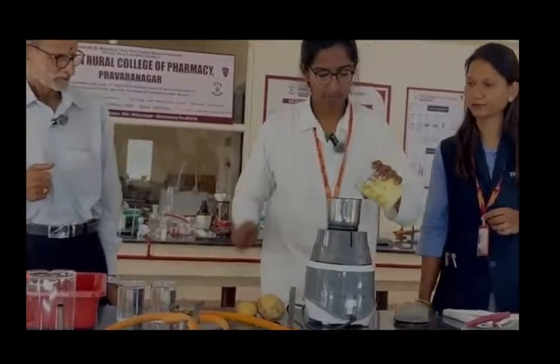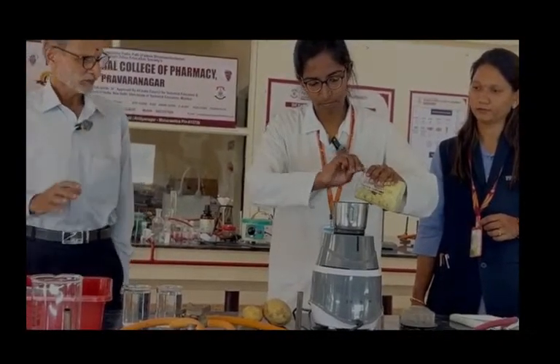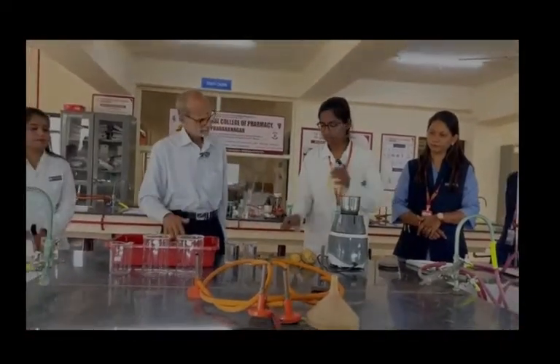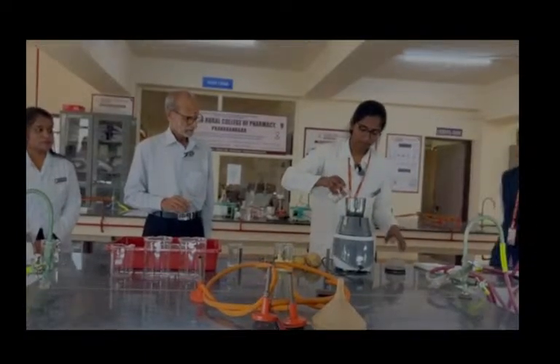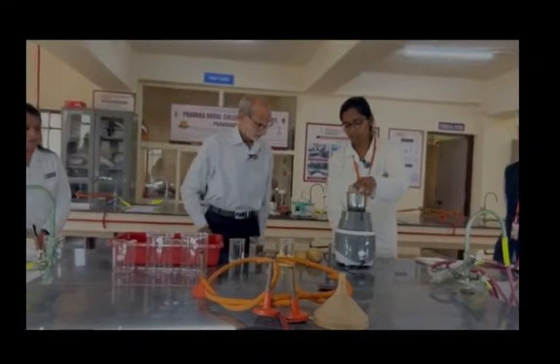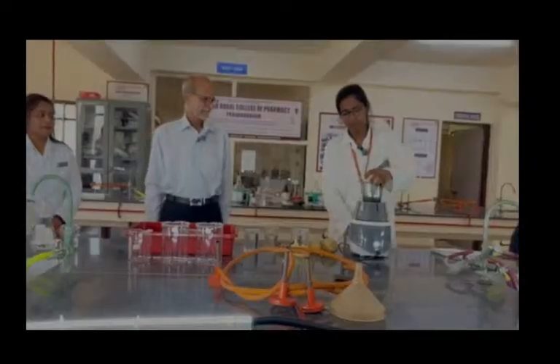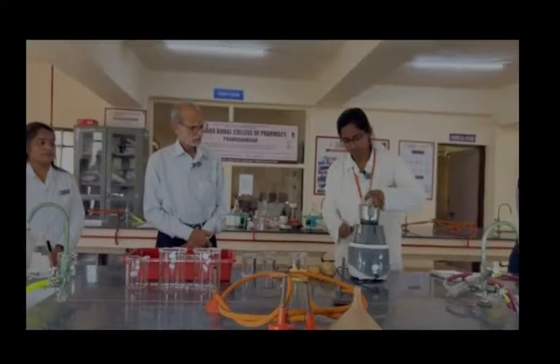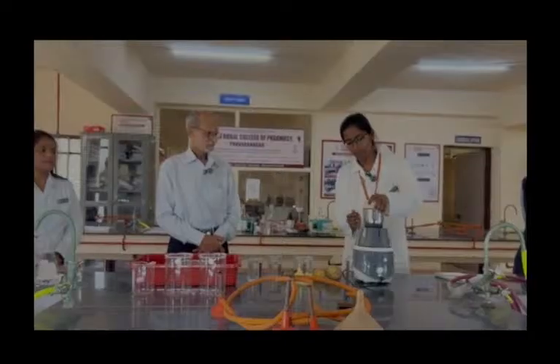The starch which is present gets separated from the cellular structure. Okay, so now we are going to make a pulp out of it and pass it through, do it fast. Add more water, by which all the starch grains which are present in the potato get passed on. Make sure you put the hand. Yeah, go ahead. Do it more. And the cellulose matter is retained on the fine mesh.